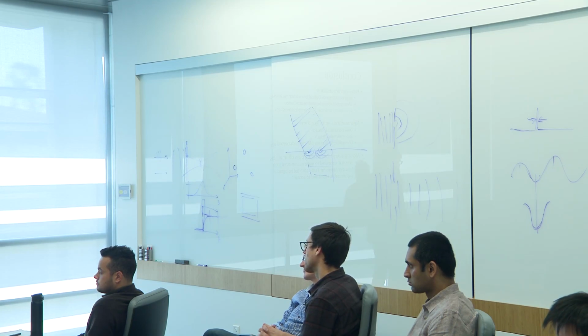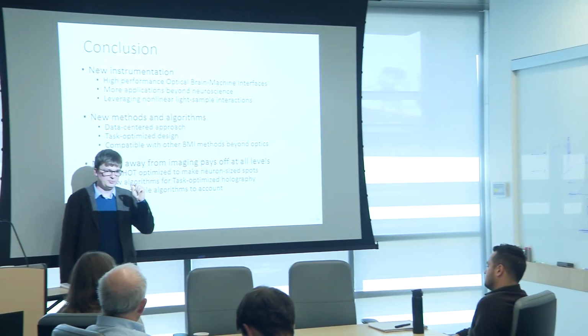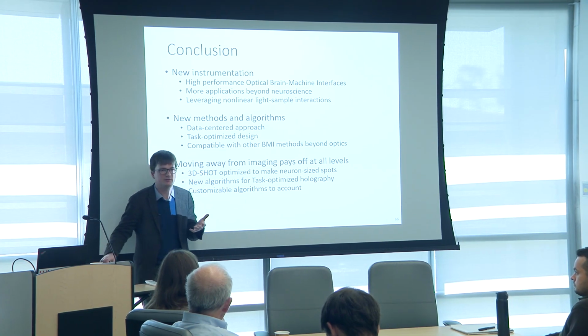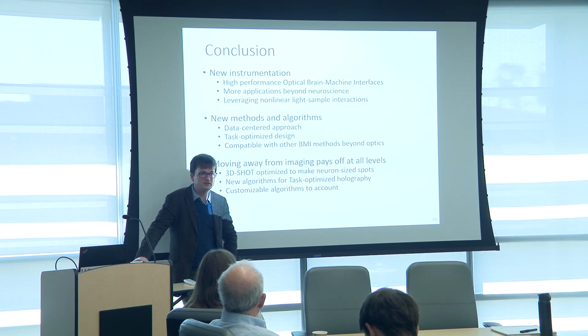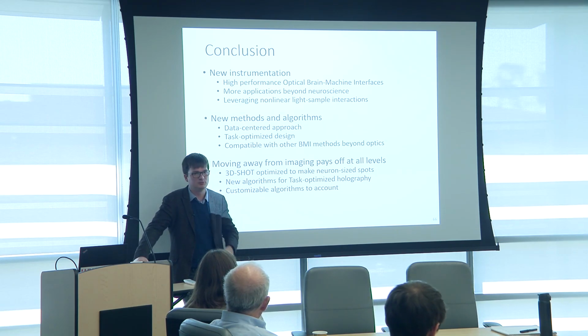And then the last thing that we sometimes forget is that SLMs on a pixel by pixel basis have noise. And that noise builds up to fluctuations that affect the phase pattern you're trying to render and affect the quality of your hologram by superposing basically an overall white noise around it. So all these things have to be addressed. Right now the money is really in the speed. Like you pay twice as much for a hologram that goes almost twice as fast. But every other axis is something that can be improved.